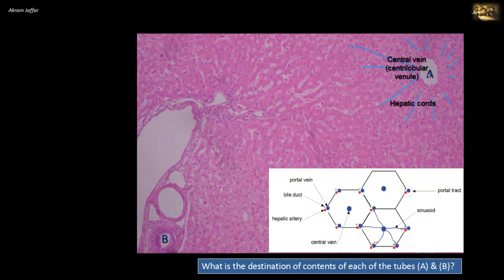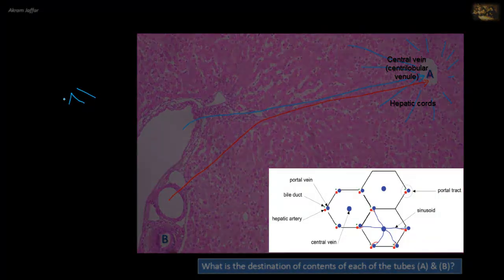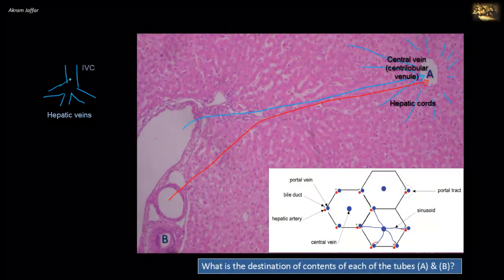The central vein is clearly lined by simple squamous epithelium — the endothelium that lines all blood vessels. You can see the flattened cells, whose shape is reflected in the shape of the flattened nucleus. These central veins are tributaries of hepatic veins. Venous blood comes from a branch of the portal vein in the portal triad, passes into the sinuses of the liver, and empties into the central vein. Arterial blood comes from a branch of the hepatic artery, also going into the sinusoids and emptying into the central vein. These central veins ultimately form three hepatic veins that open into the inferior vena cava, going into the right atrium of the heart.